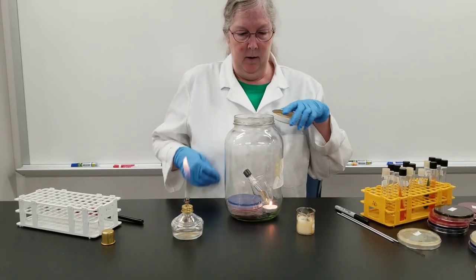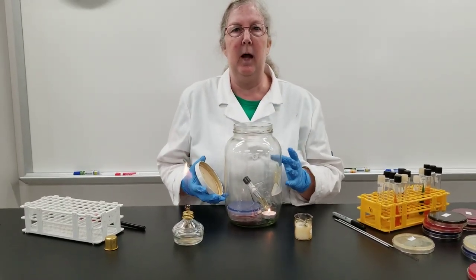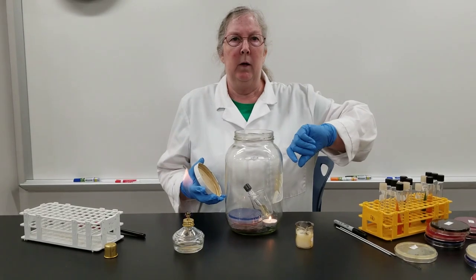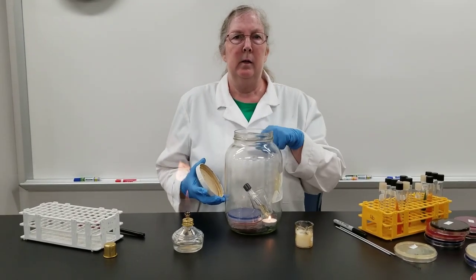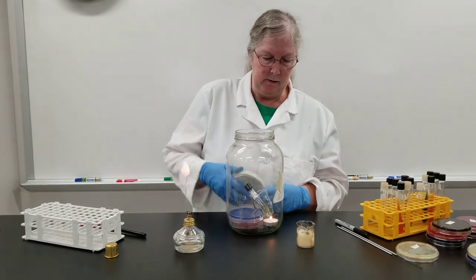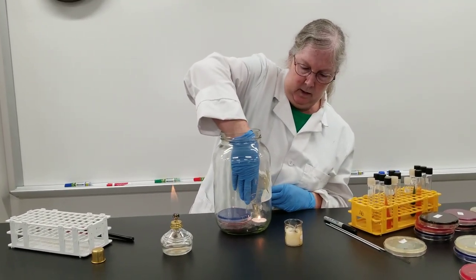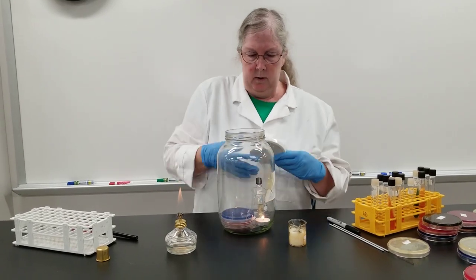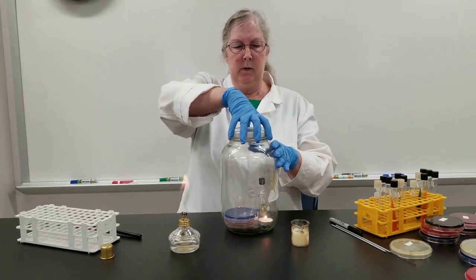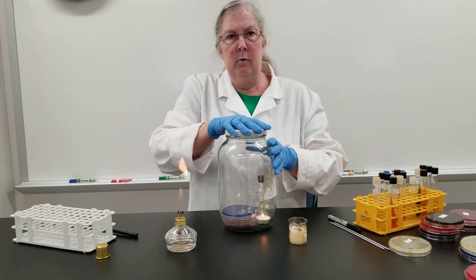This is a fancy candle jar. Hospitals often have special packs where you break a little ampule, stick it in there and it ties up all the oxygen. We go for the less expensive but tried and true way of having basically a pickle jar with a candle in it. We use the premise that when we seal this up, the fire is going to burn only as long as there's adequate oxygen in there.